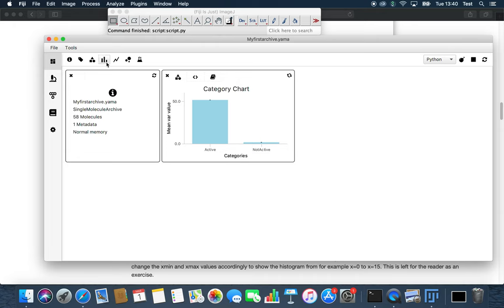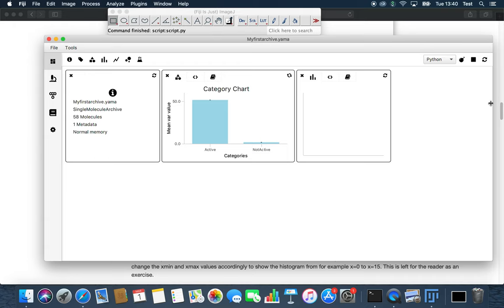We click on the histogram symbol. We copy and paste the code. We can easily modify attributes like number of bins or the range.